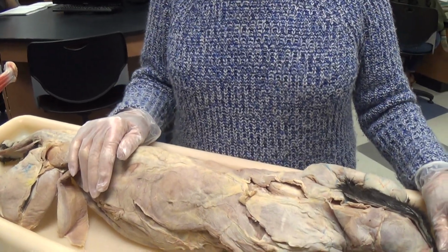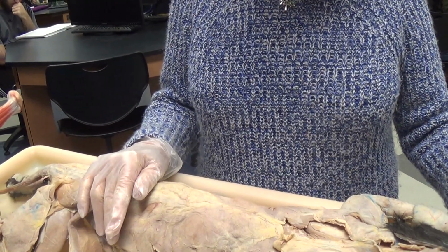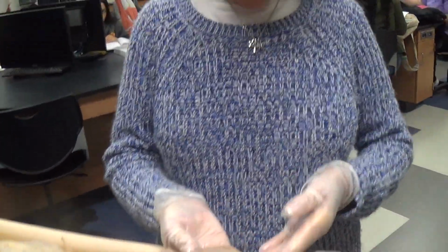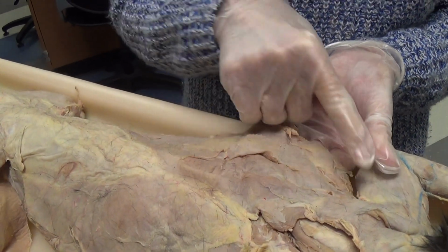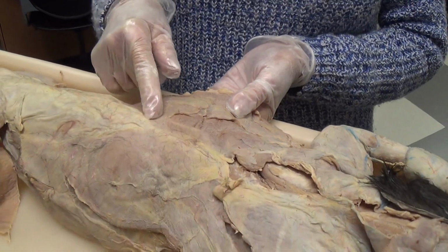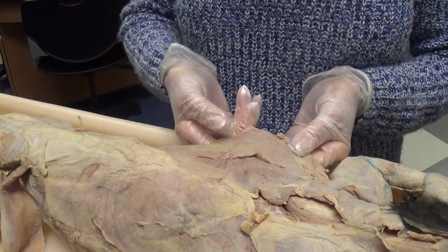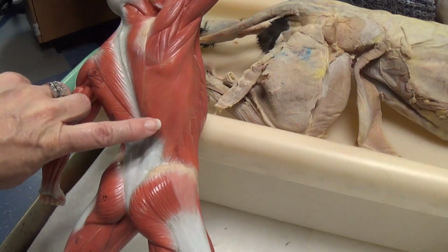Alright, so we're going to start with the latissimus dorsi, the broad muscle that extends from the middle of the back to the humerus. You can find it starting down the side of the back to the lumbodorsal fascia, and its job is to pull the kitty's forelimb dorsally and posteriorly. Human, right there.